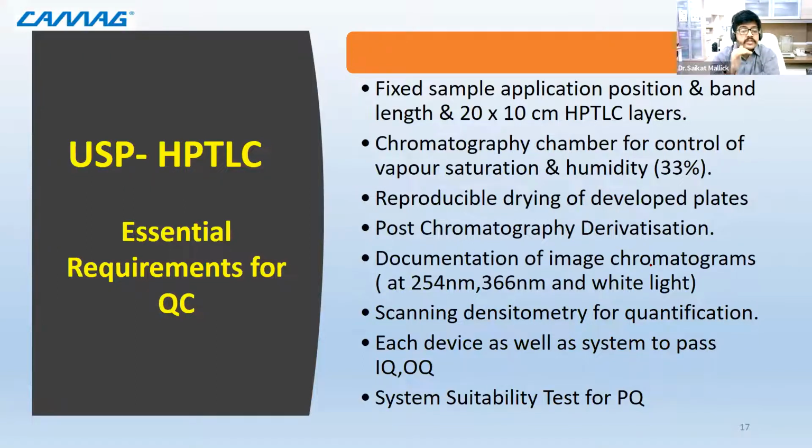And then finally, system suitability test. Until now, there was no system suitability test in HPTLC. We only had it in other formats of chromatography, but here in HPTLC also we have incorporated a system suitability test. This is particularly pertinent where you have multiple components being investigated at a time, and you can use standards. There is a recent paper by us and Camag, in which we developed a universal SST mixture, as it is known.